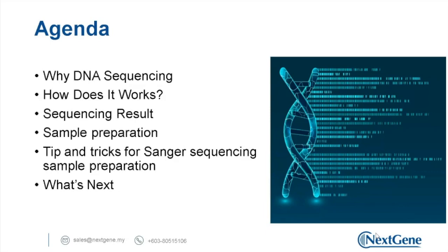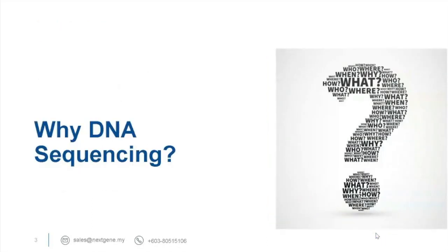So next will be some tips and tricks to give a better quality sample to send to the sequencing house. And finally, I will end with some advancement of DNA sequencing, just a short slide on the advancement of DNA sequencing technology. Okay, so let's move on to the first topic of today, which is why DNA sequencing.